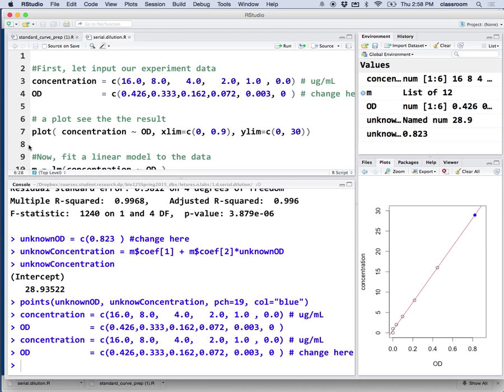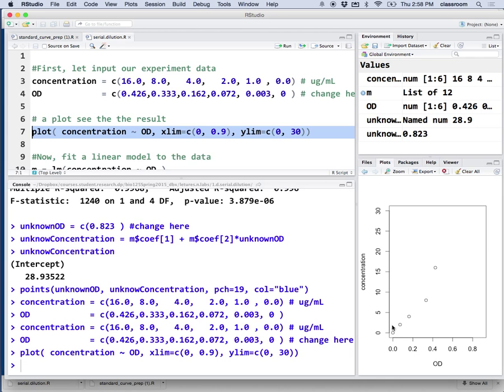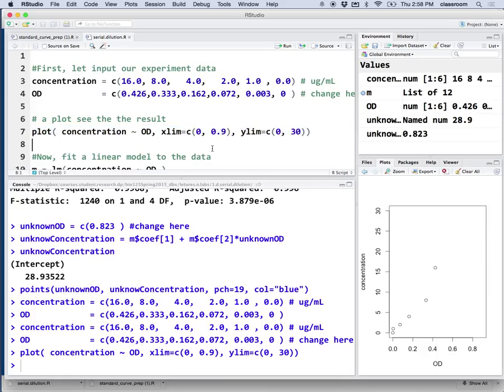So I'm going to highlight this line and click run, there. More or less linear, it's just the last point a bit high. Don't worry about that, that's happened quite often.